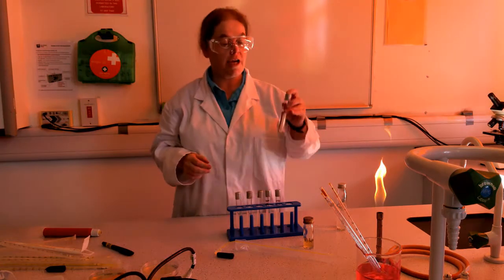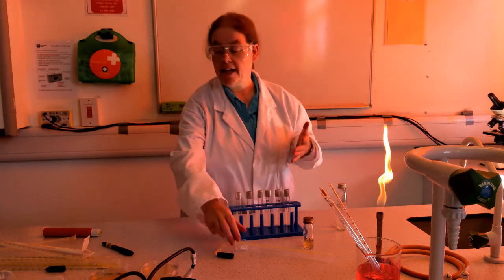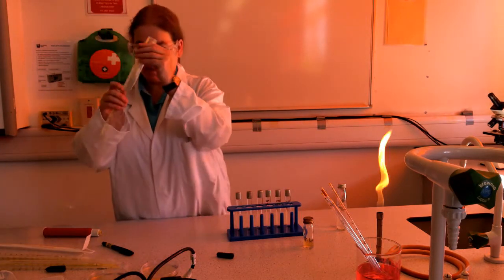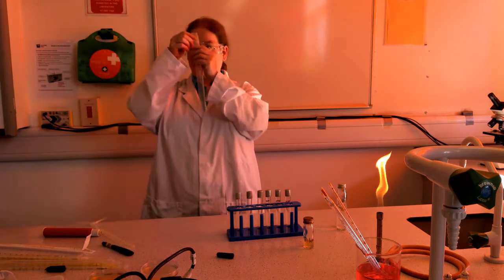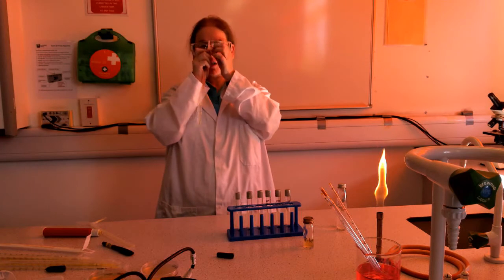Give the tube a shake to distribute the bacteria evenly. And then, as they say, lather, rinse, repeat. So I will now just carry on diluting twice more.